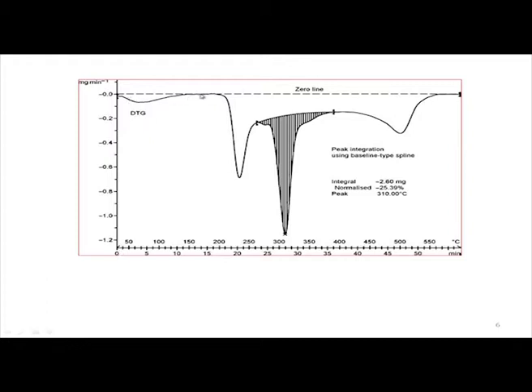But in this particular plot, this crest, the top, and the depression is at this particular point of temperature. We see that when it is going up, it is not reaching your original 0 line. Sometimes it is not so easy to get the plot touching the baseline before the start of the plot, and at the end also going down again to the same one. It is not happening in any kind of plot.